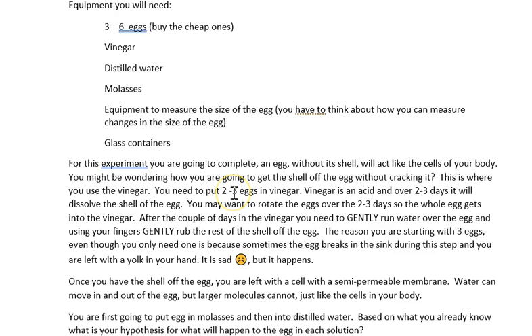This is why I have you start with more than just one egg, because it's in the vinegar, the shell will dissolve off, but then you need to wash more of it off. And as you're washing more of it off, if you're not gentle enough, or if the water's on too high, there's a chance the egg may break. So you want to start with more than just one egg. I recommend 2 to 3 eggs, and hopefully one of those will survive. If you end up with more than one egg that would work, that's okay. It's better to end up with more eggs than no eggs.